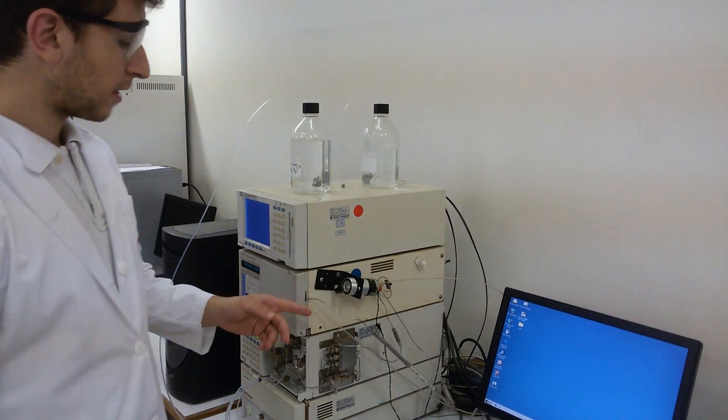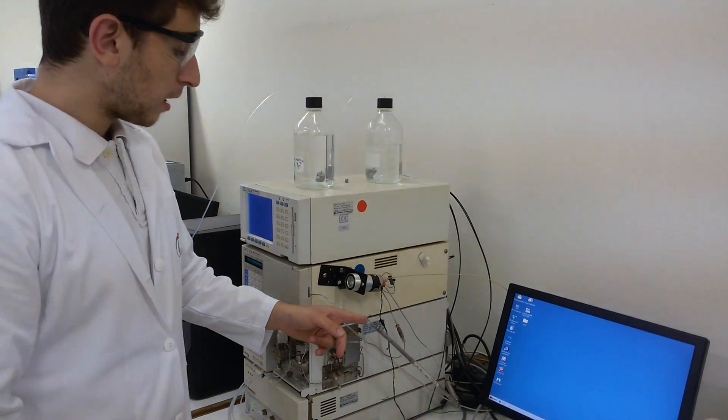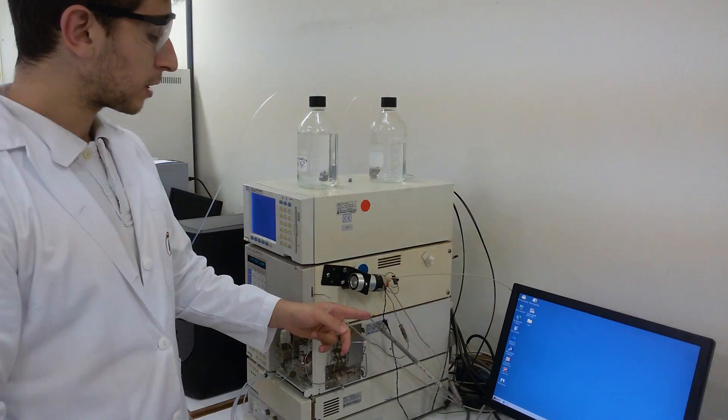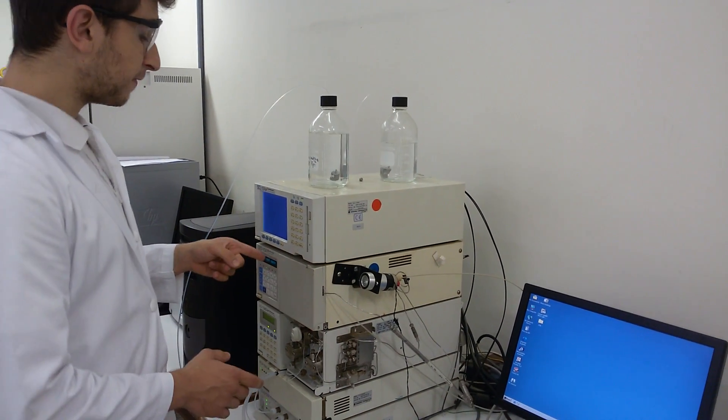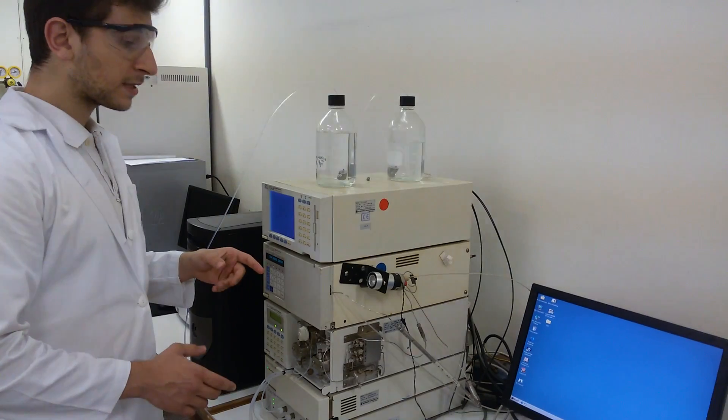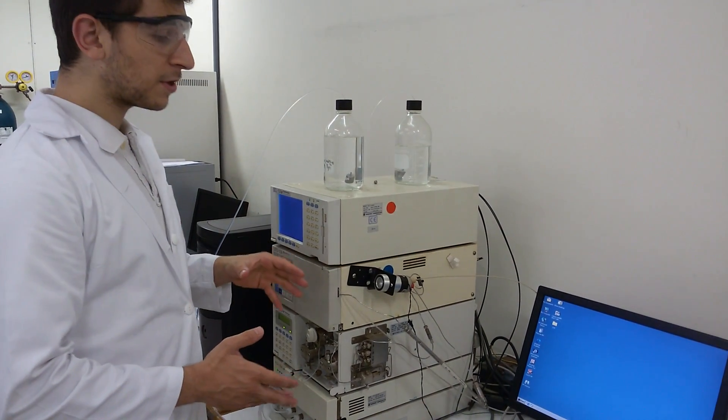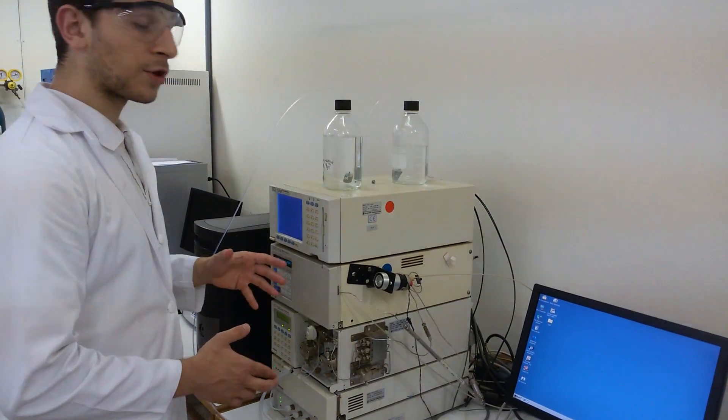Once the compounds are filtered, they will go out of our column and enter our UV detector. The UV detector will measure their absorbance, because they are organic molecules.